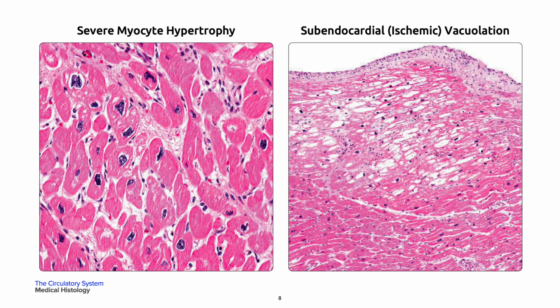On your right, your subendocardial myocardium is furthest from coronary blood flow but too deep to receive oxygen and nutrients from your luminal blood. In chronic ischemia, the starved cells will show vacuolation.